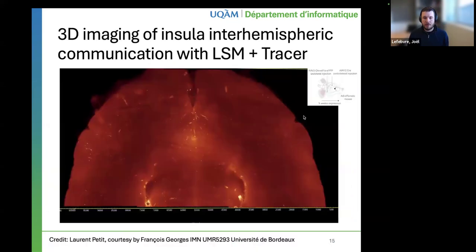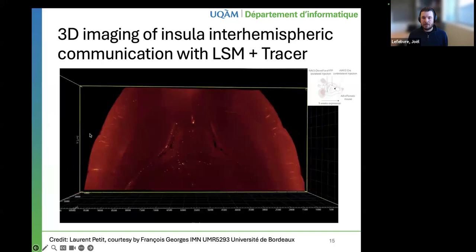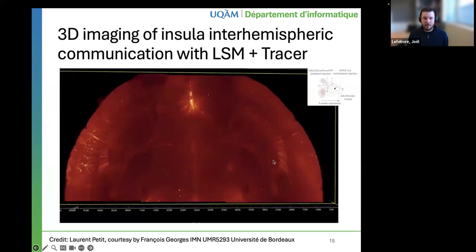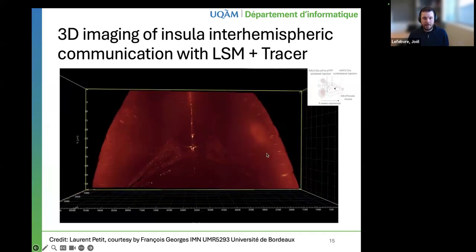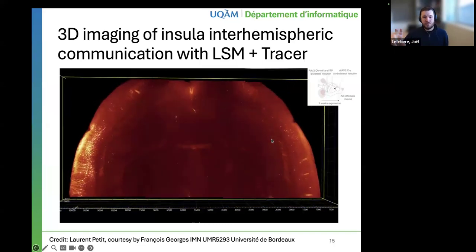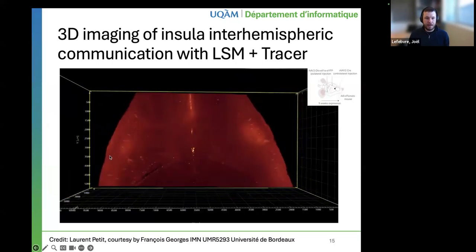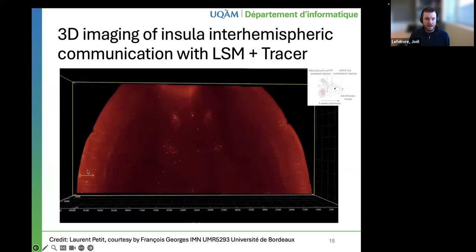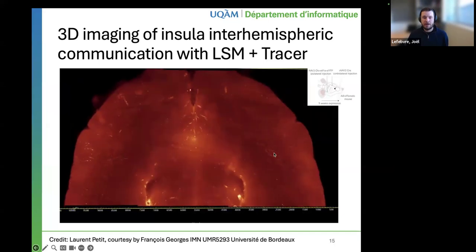The first one comes from my collaborators in Bordeaux. Here they injected, again, two viral tracers, and only the neurons that were connected by both viruses after the projection emitted fluorescence. And then after that, they sacrifice the mice, they perform tissue clearing, and they image that sample with light sheet. And here, this is a video, but if you focus in some part, we can see the individual neurons, and we can also track them, see the collaterals, and we can see where those neurons project inside the brain.